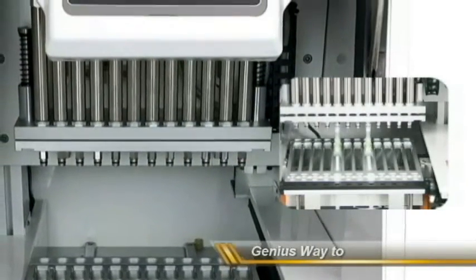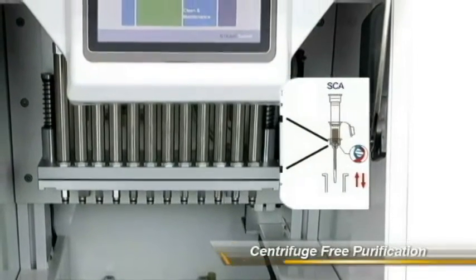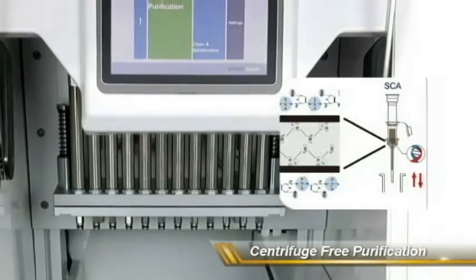The technology utilizes the non-directional mirror structure of silica and completely eliminates the need for spin-downs on a centrifuge.